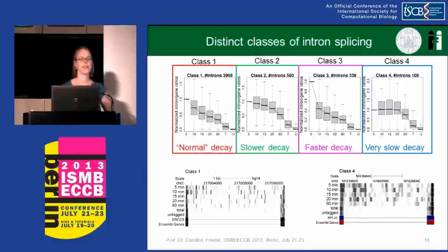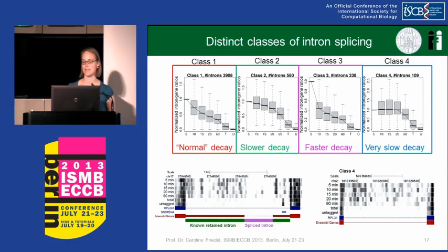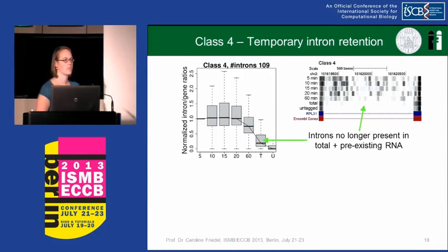And maybe this reminds you of one of the pictures I showed you before, the example of a known retained intron, where we also have this case that the reads are there until 60 minutes 4sU RNA, and then they are basically gone. So we hypothesize that this class 4 might actually consist of new examples of intron retention events. But if these are really intron retention events, the interesting thing about this is that they seem to be gone in total and untagged RNA. So they are no longer present in old RNA samples.